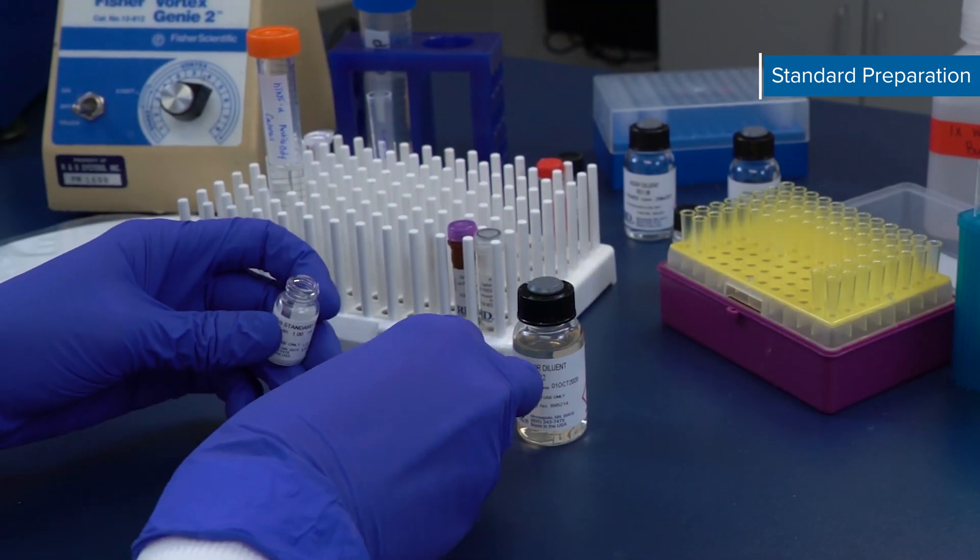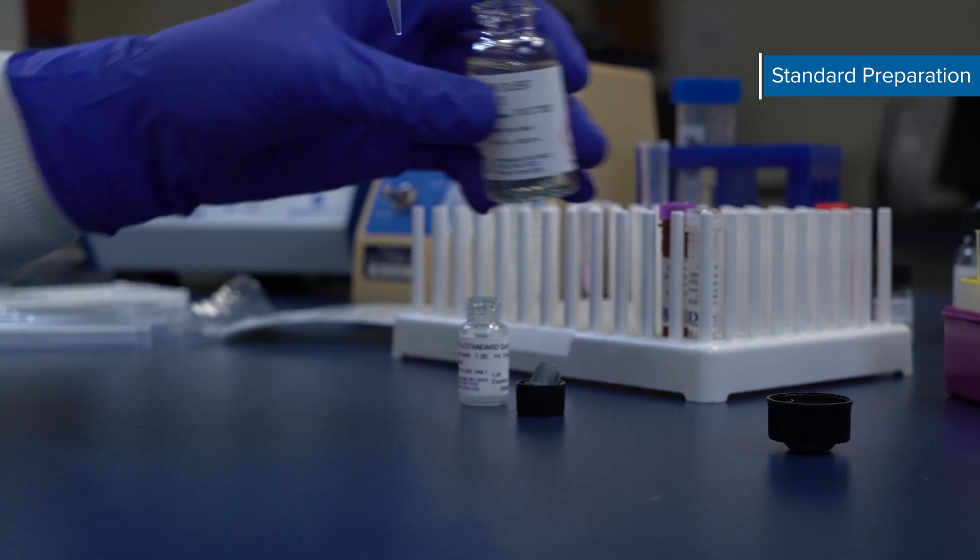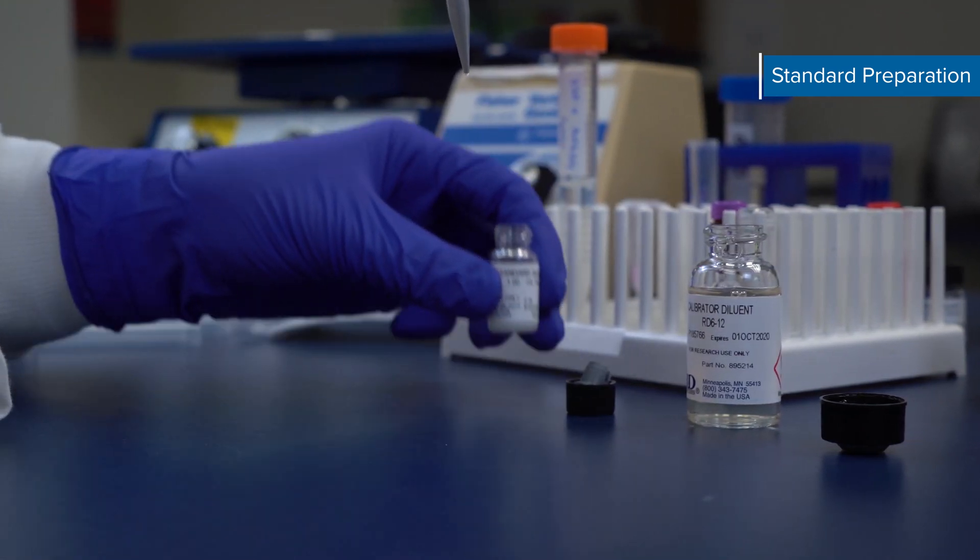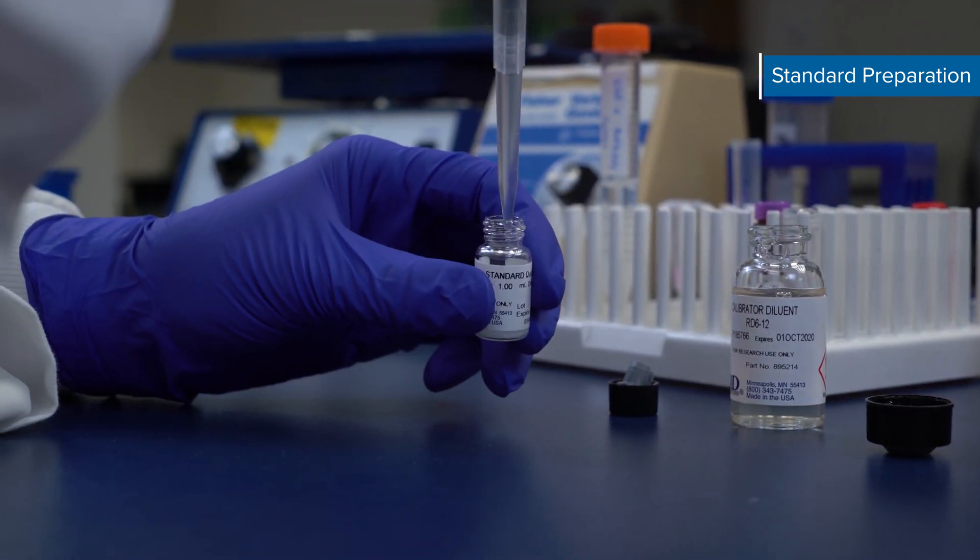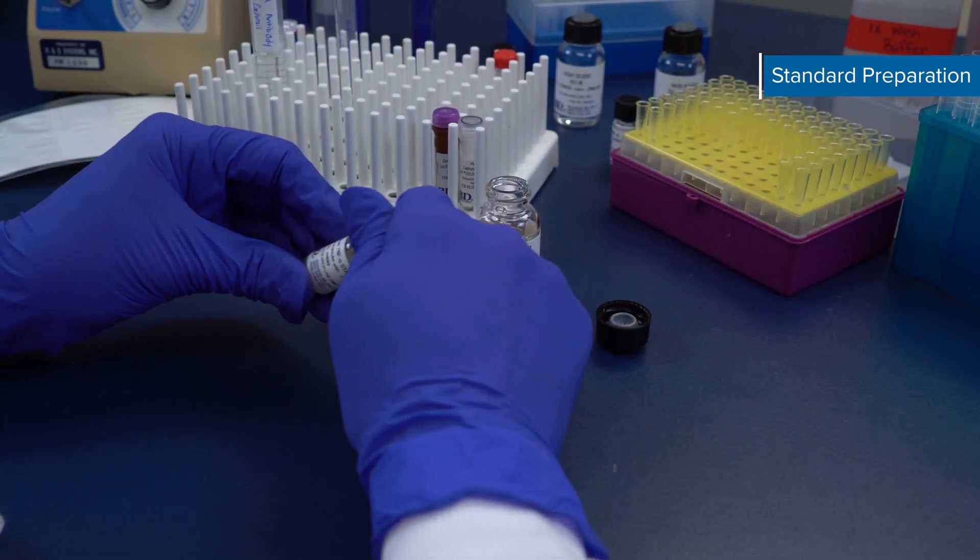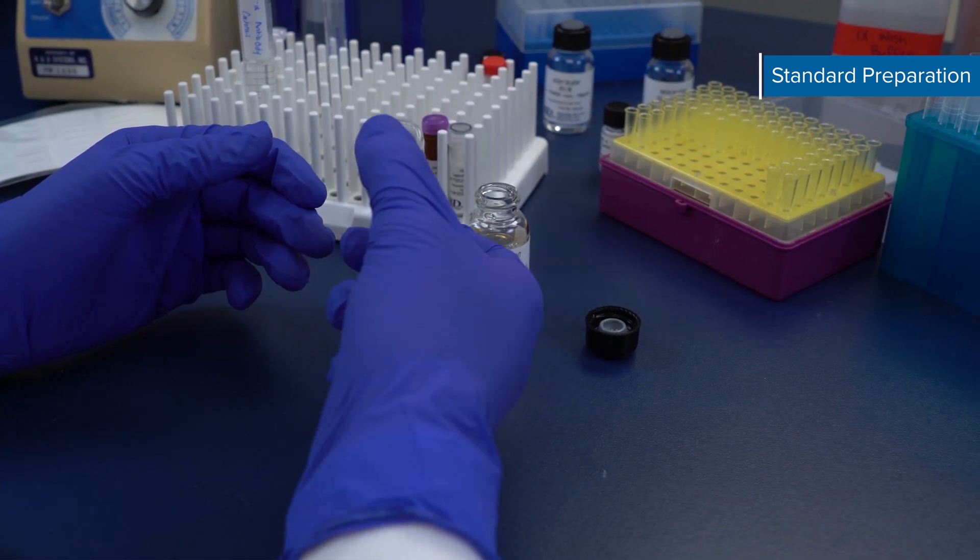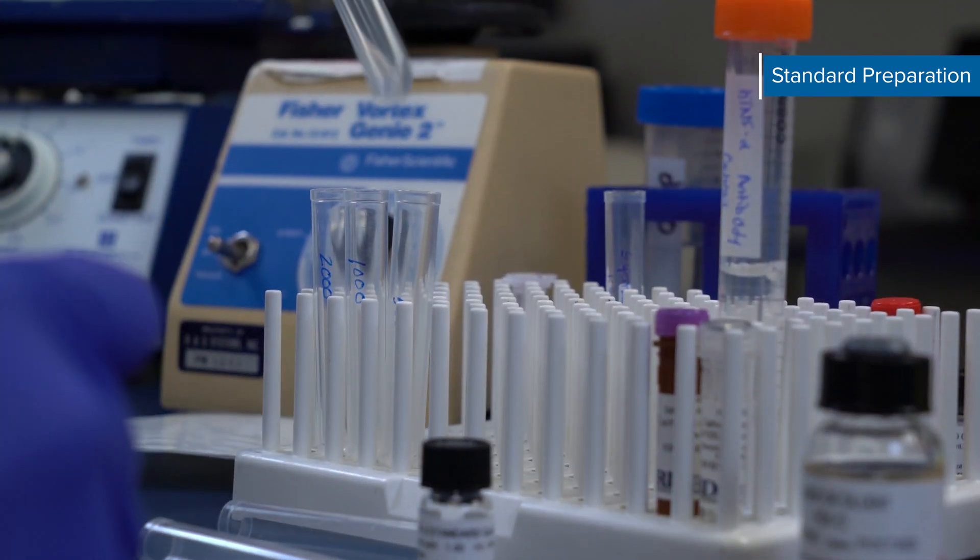Next, prepare your human TNF-alpha standard. Refer to the vial's label for specific reconstitution volume. Reconstitute according to the kit booklet. This reconstitution produces a stock solution of 20 ng per mL. Gently mix the standard to ensure complete reconstitution and let rest for a minimum of 15 minutes prior to making dilutions.